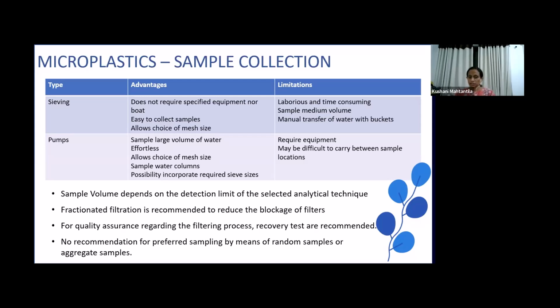However, during the filtering process, recovery tests are recommended to assess the sample losses or additions during the filtering and transferring. There is no recommendation for preferred sampling, meaning random samples or aggregate samples to be collected. Still, there's no such recommendation.